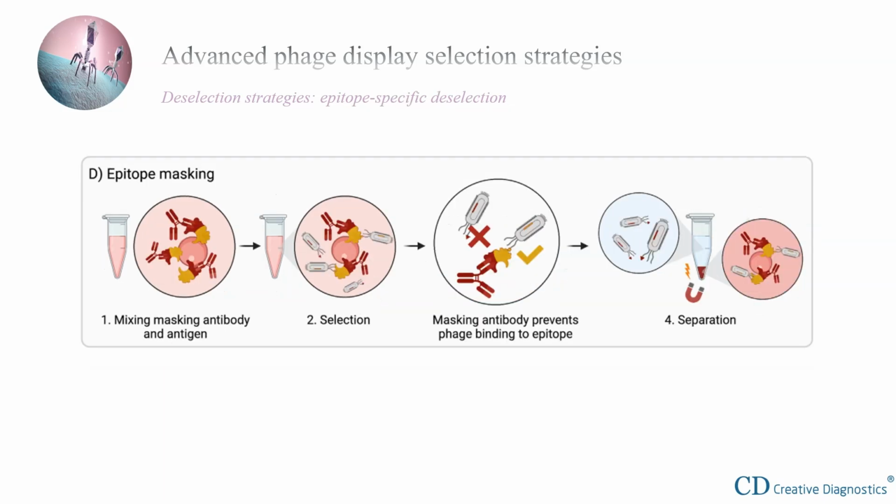For therapeutic antibodies, the specific epitope on the target antigen that an antibody binds to is often crucial, as it determines the antibody's therapeutic value. To direct antibody binding to a particular part of the antigen, various techniques can be applied. For example, to find binders against the ligand binding site of a receptor, the elution step can be performed by adding high concentrations of the ligand, which will elute only antibodies that compete with the ligand for binding. However, a major drawback of this strategy is that mainly low-affinity antibodies are eluted, making this method mainly useful for reducing the amount of low-affinity binders.